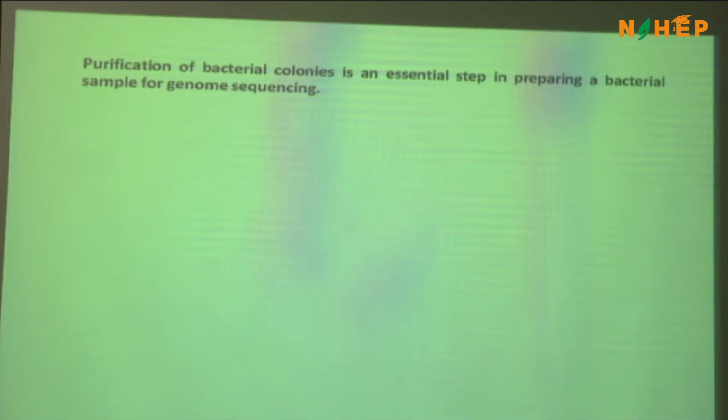Here come the DNA fingerprinting techniques, right? One of the very elegant DNA fingerprinting techniques developed for bacteria is what is called REP-PCR. There are different variants, but the one which is very popular is BOX-PCR. If you use BOX-PCR fingerprinting, that would reveal finer differences between two closely related bacterial species, right? Just by counting the number of amplicons, the presence or absence of certain amplicons, you can very easily segregate very, very closely related strains or isolates of the same species. You have to do it, okay?